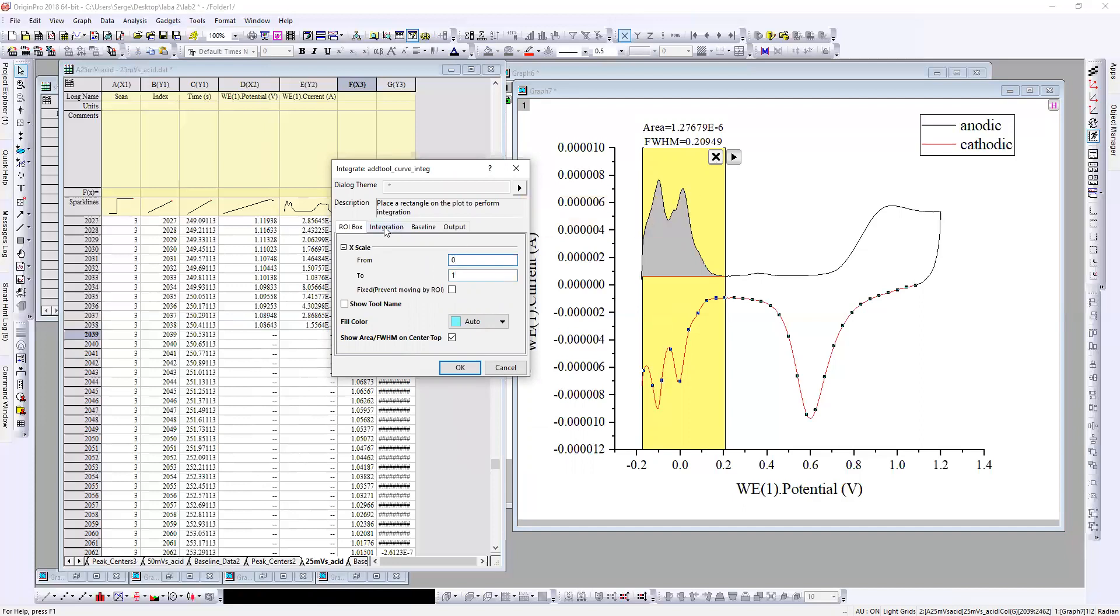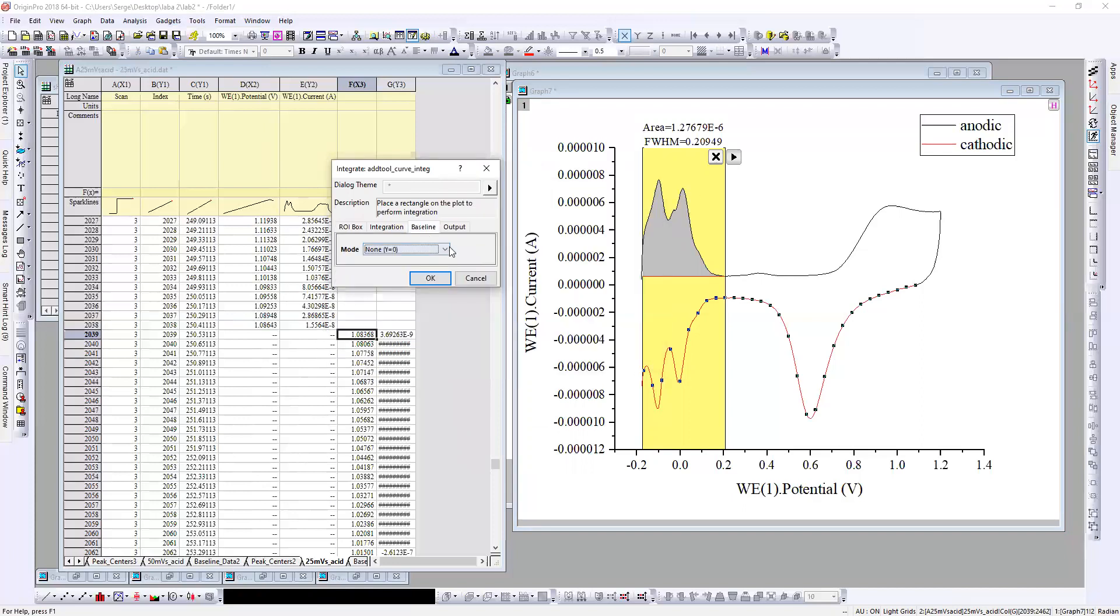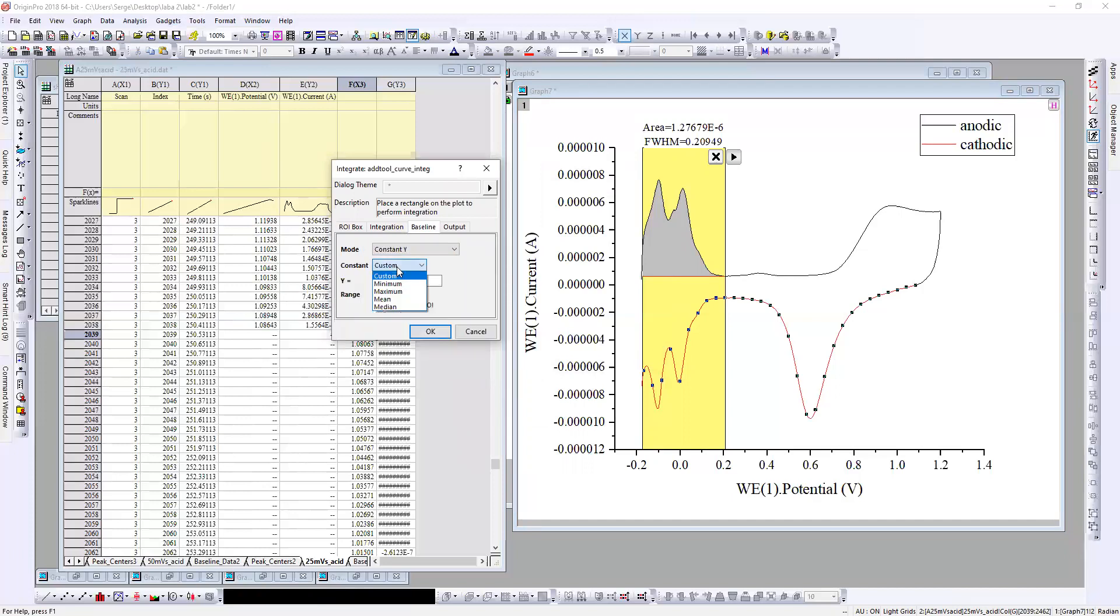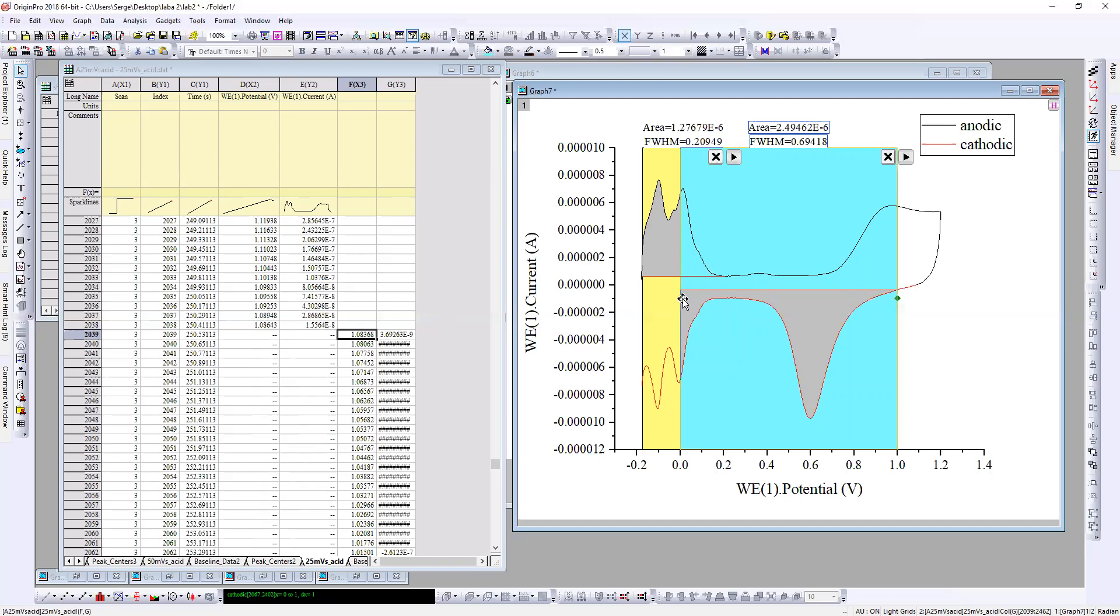Very important: baseline. And here I choose maximum. Click OK, yes, and just move.